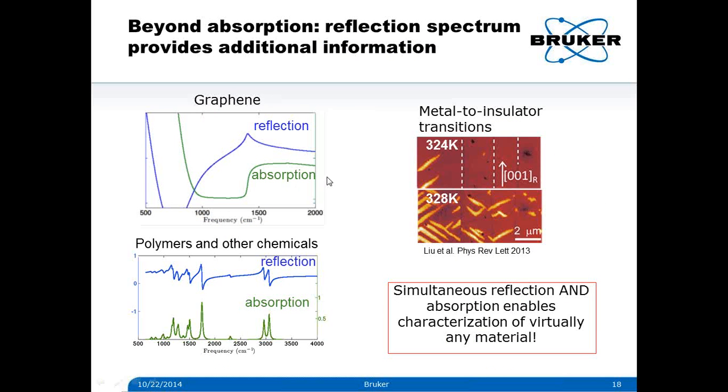And the last part, graphene, I can show you here already, where we plot the theoretical reflection and absorption that you would measure with the Inspire in the infrared range for graphene. You see distinct features depending on frequency, and this is something where you can distinguish and characterize your material.